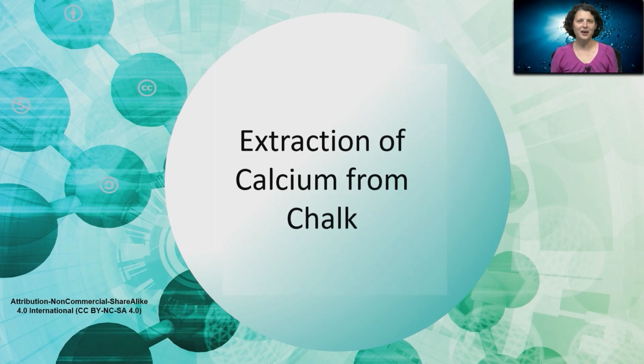My name is Dr. Esther Trufan, and in this video, we're going to explore the extraction of calcium from chalk. Chalk is a good source of calcium because it's mostly made up of calcium carbonate.